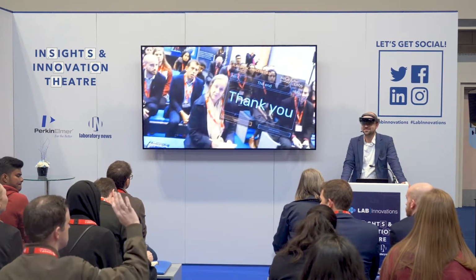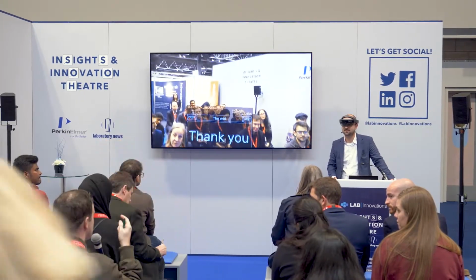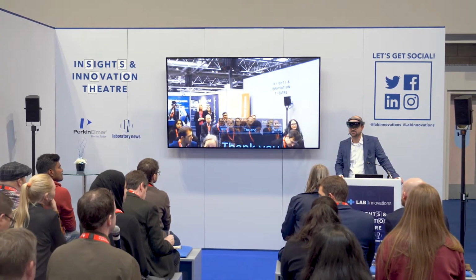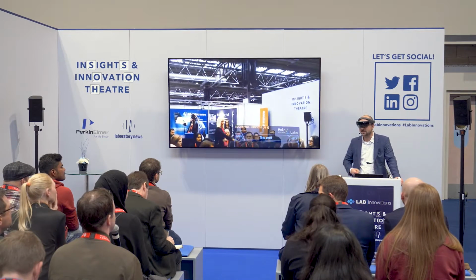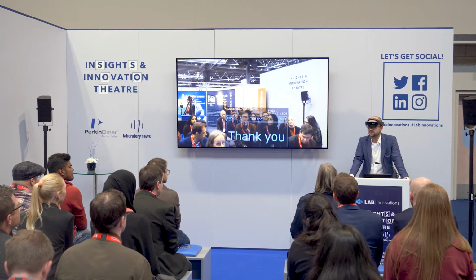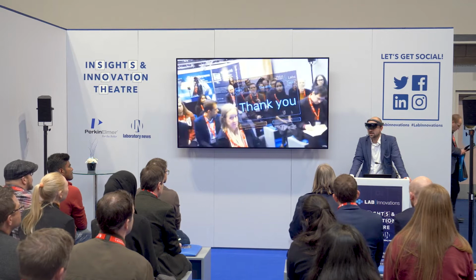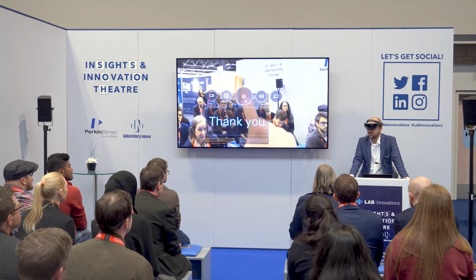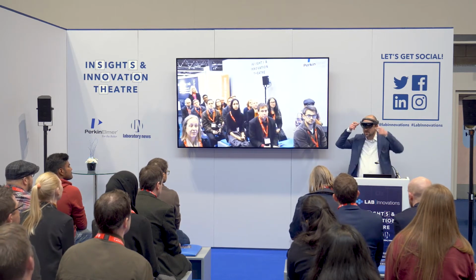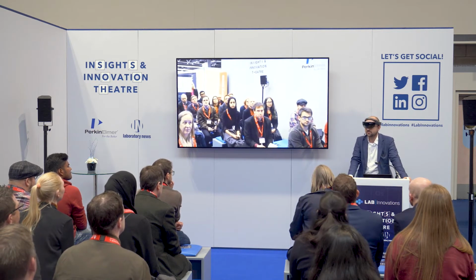Any more questions? Do you think it's dangerous, like people walking about in the lab with those on? Would it be very distracting, like walking into things and different things like that? Okay, so I will show you something more. It's not in the presentation, but for example, now I'm switching it off. So if I'm switching it off, I don't have any picture in front of me, so it's not distracting. Also, with version 2 of the HoloLens glasses, you can put this part up and then you have a clear view.